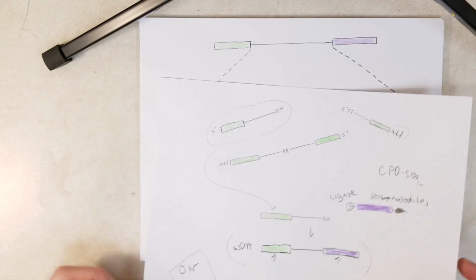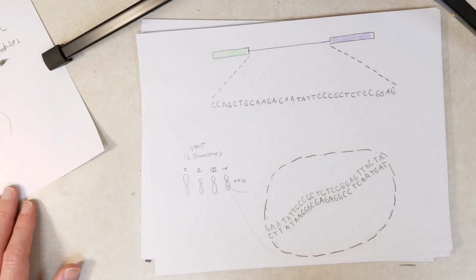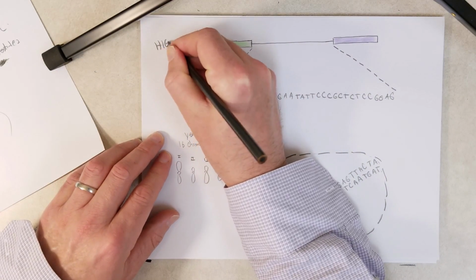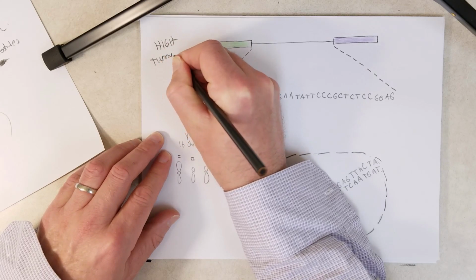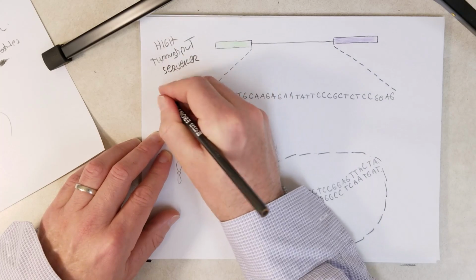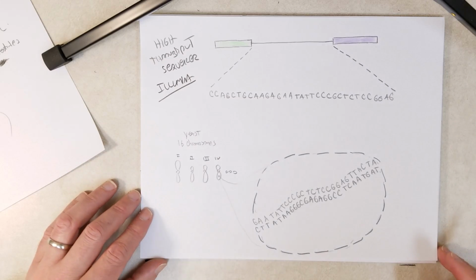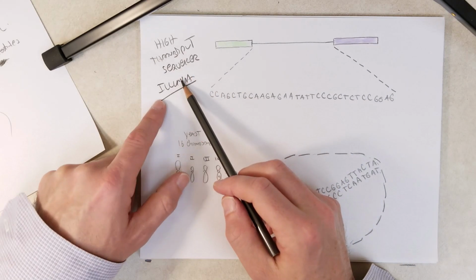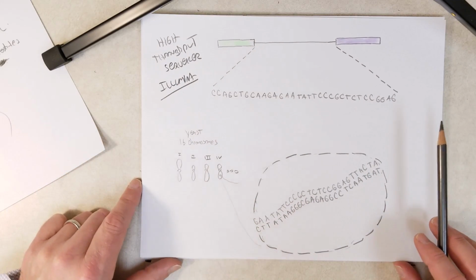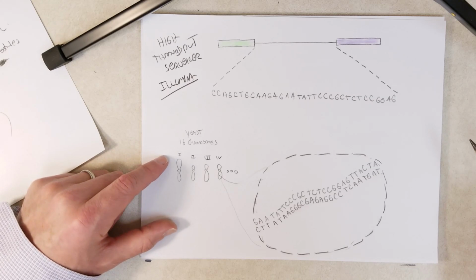And the next step is to load those, and they need a little more processing for this to work, but essentially load them into a high throughput sequencing machine. A sequencer. And a common company that makes these machines is Illumina. So these sequencing machines can sequence millions of DNA molecules at the same time. And then when they're done, we essentially get a giant text file with each DNA sequence.